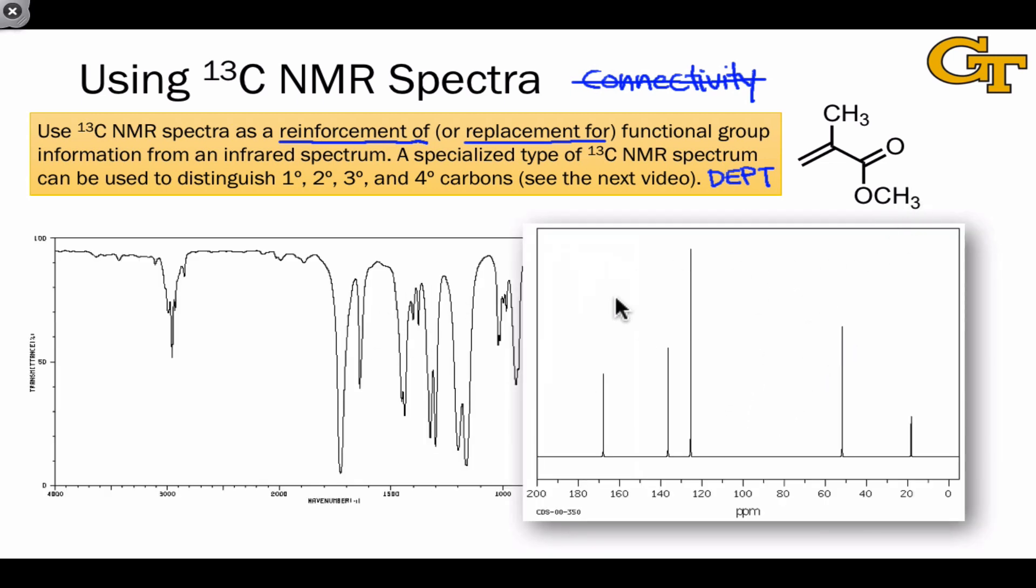Here are the infrared spectra and the carbon-13 NMR spectra for the molecules shown here, which is methyl methacrylate. The IR spectrum indicates clearly the presence of a carbonyl group in this molecule. And we see a downfield peak that indicates the presence of a carbonyl group as well. And in fact, both of these, with a little bit more care, we can identify with an ester functional group.